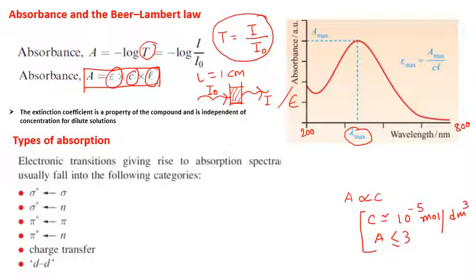For example, if you have dissolved some inorganic complex or organic molecule in a solvent like chloroform or DCM and you get this spectrum, the spectrophotometer automatically cancels the solvent absorption. Therefore this absorption spectrum is exclusively for your compound, not from the solvent.